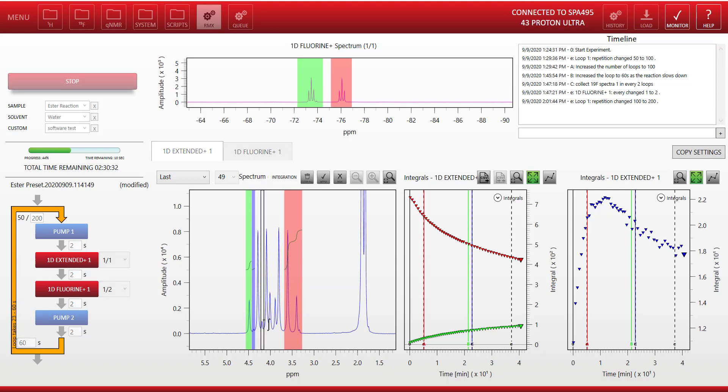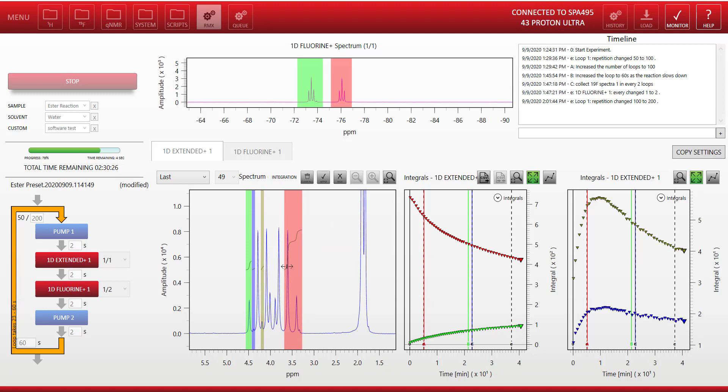In fact, there's another peak on the right there that I can also put onto that second plot, which seems to be part of that same intermediate product that I'm observing.